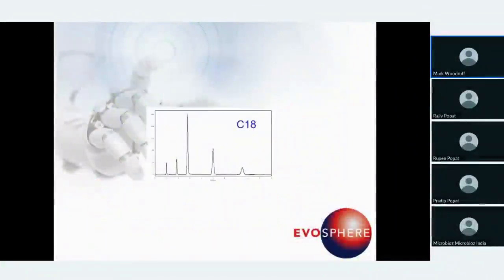So when we choose a column, so we're looking for selectivity, we're starting our method development, most people would tell me that they choose a C18 column as their first starting place. Where do you go from then if C18 doesn't work? So C18 is a hydrophobic mechanism. That is how it's retaining our compounds, our analytes.